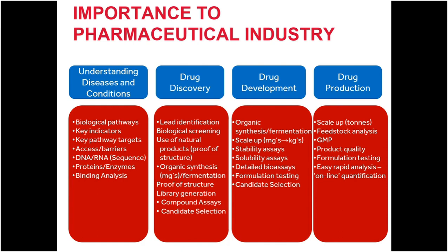These are our starting materials that are then used to produce our active ingredients. And it's also used to ensure product quality, and because it's very amenable to this, it can be used in a production pipeline. So you can essentially flow reaction mixtures over a spectroscopic analysis technique to tell you something about that production process and whether it's proceeding correctly or not. So you can look for changes in your production pipeline. And because of the way spectroscopy works, it makes it very easy to incorporate this into automated equipment.